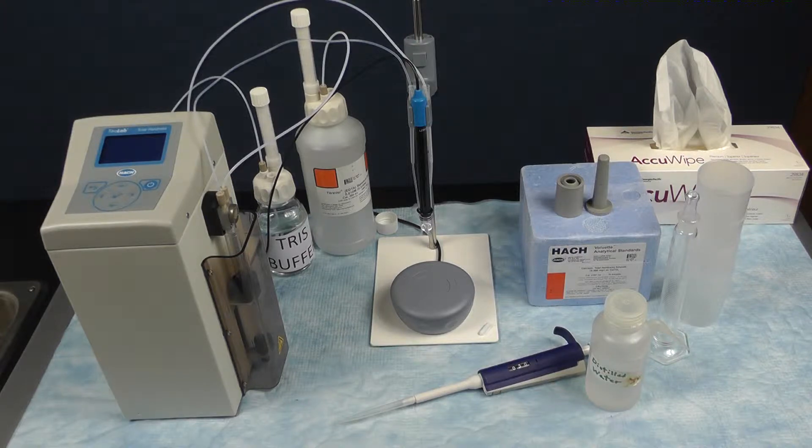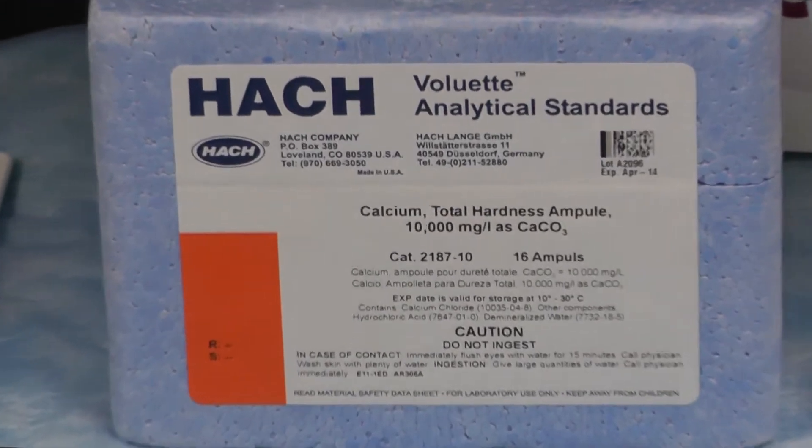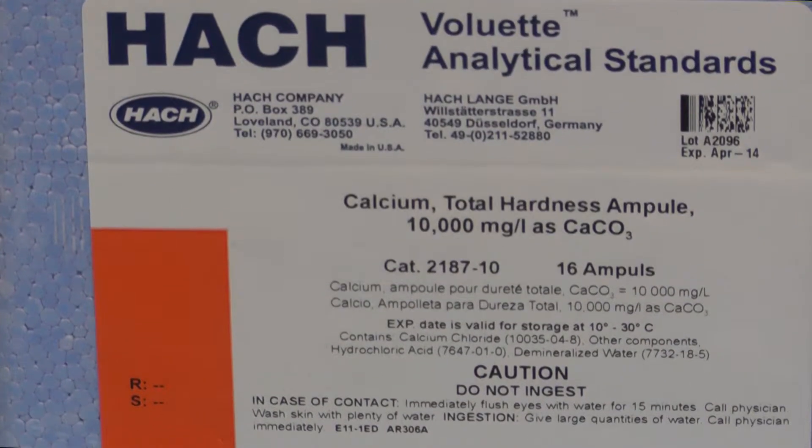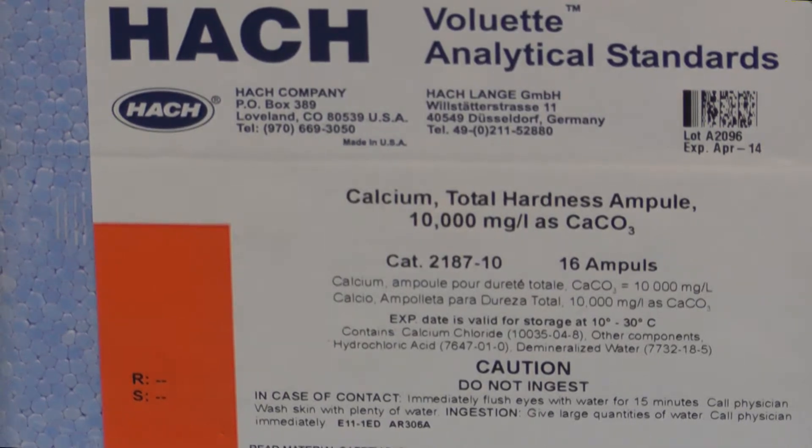You should already have all the components of the instrument assembled and reagents for the analysis as described in the manual. You will need the following additional reagents and labware to perform the analysis. We will perform the analysis using the Hach TitraLab for total hardness and a Hach standard of 10,000 milligrams per liter hardness as CaCO3.